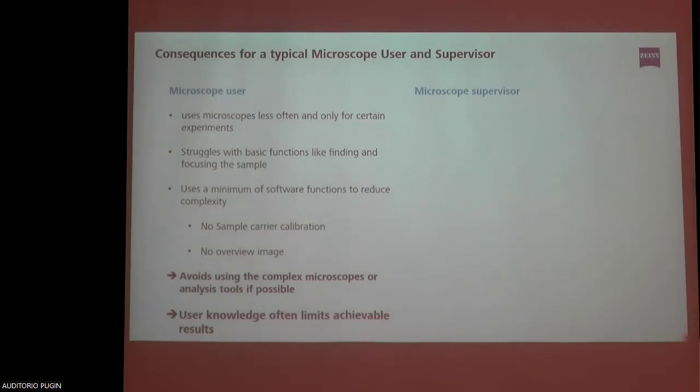So what you would do in the microscopy field is you would try to just use the buttons or the microscopes that you are comfortable with, and the rest you would really leave behind, because you don't have time to understand how it works. So what is the big problem? Not so much for the microscopy producers, but for research in general, is that you could do so much better if you would simply know how to do it.